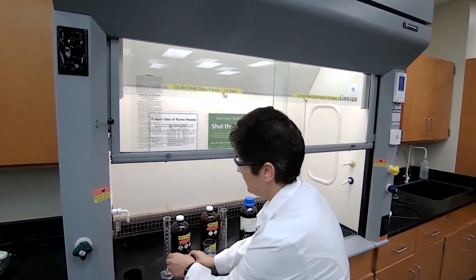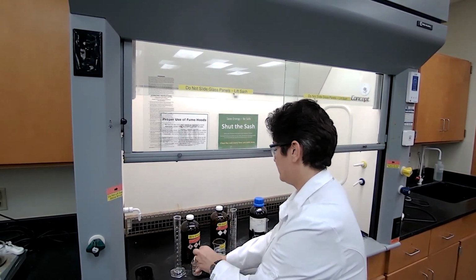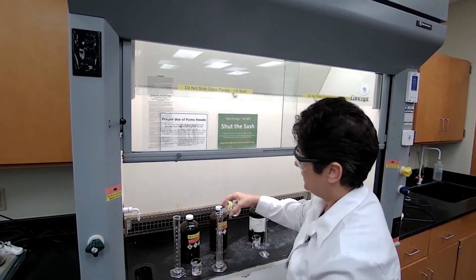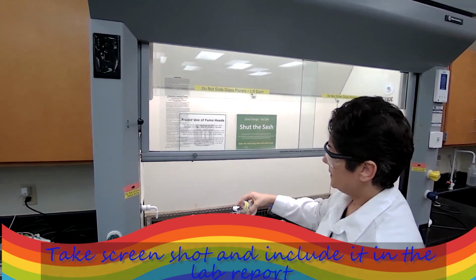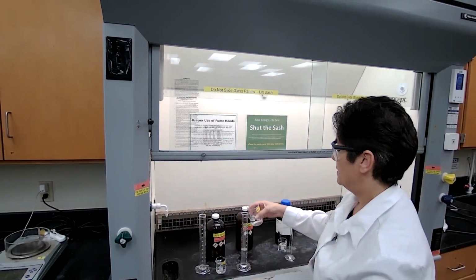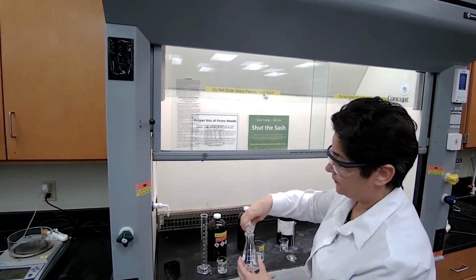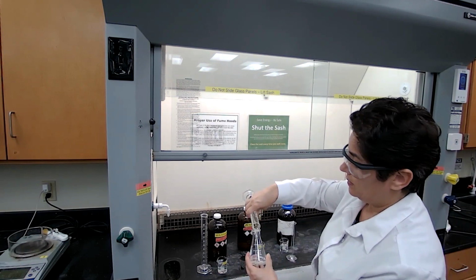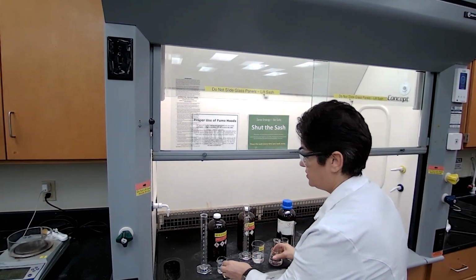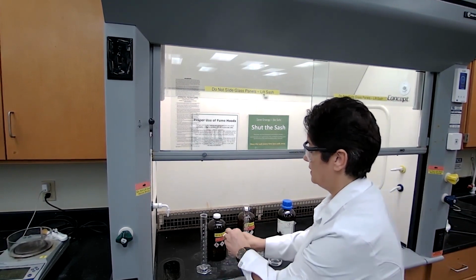We are using 40 milliliters of sodium hydroxide. We first measured 40 milliliters of sodium hydroxide, then add it to a 125 milliliter flask. We also measure 30 milliliters of 95% ethanol.